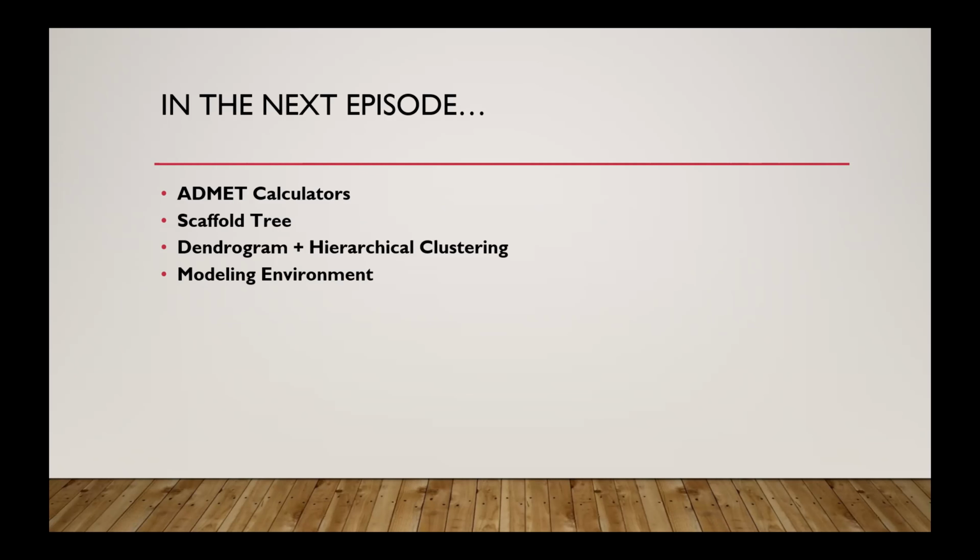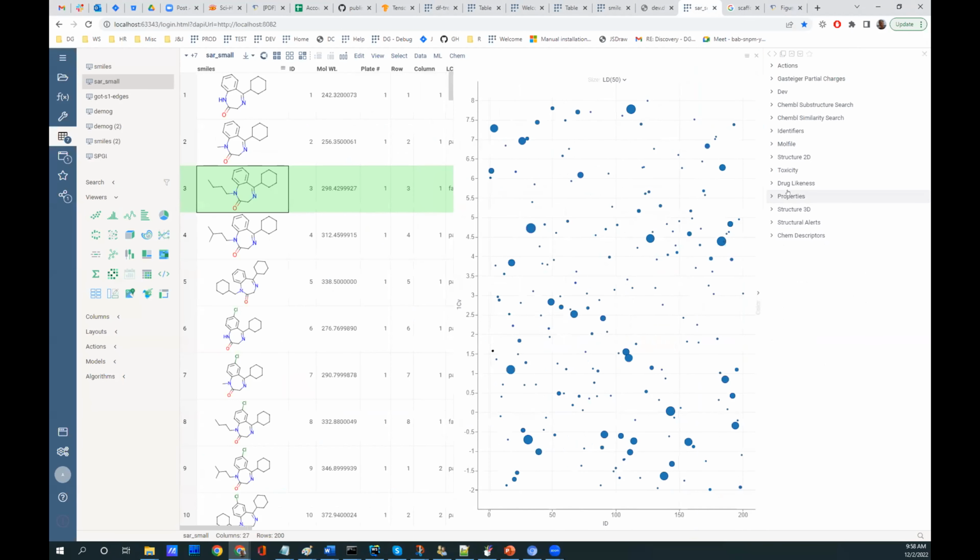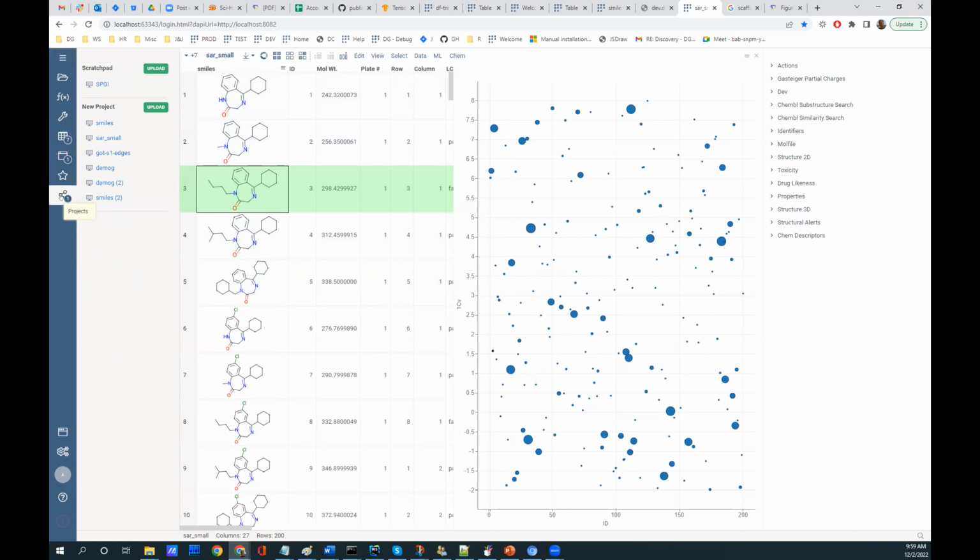So when you're actually looking at the table or any kind of data inside Datagrok, is there a clear indication as to whether this is local or persisted in the project? Yes. So you have to open the projects tab, and actually, remember in the beginning of the demo, I uploaded a project and shared it with someone. This is the project. I didn't give it a new name, so it has the silly new project name, but it's a separate project that is uploaded.